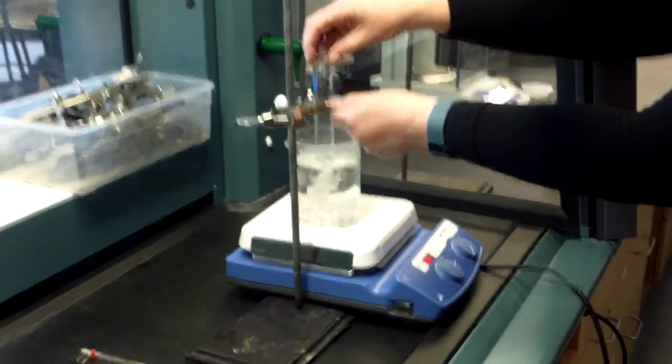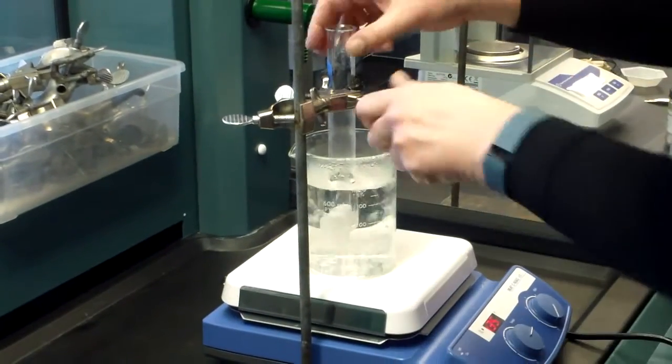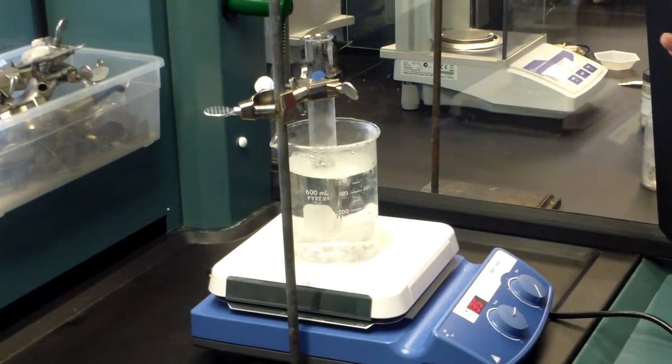Clamp down very carefully. Do not clamp down hard. And whatever you do, do not hit anything onto the bottom of the test tube. It will shatter. And it makes a mess because, among other things, naphthalene is non-polar and it doesn't dissolve in water. It does all sorts of weird things.